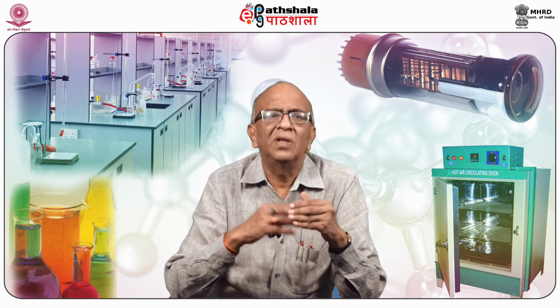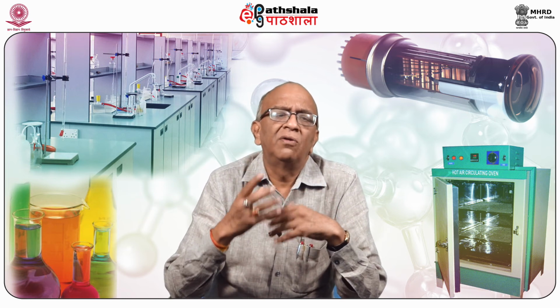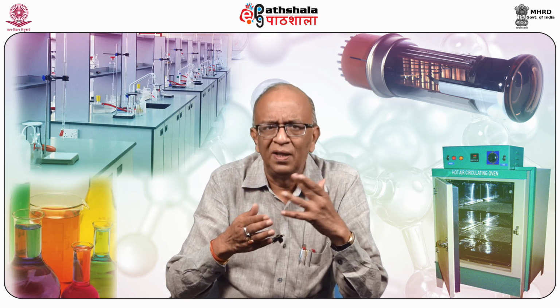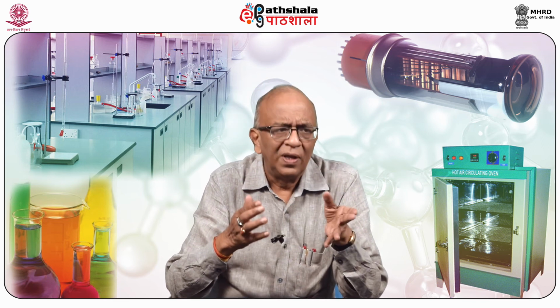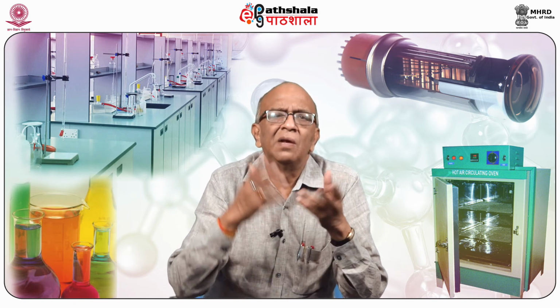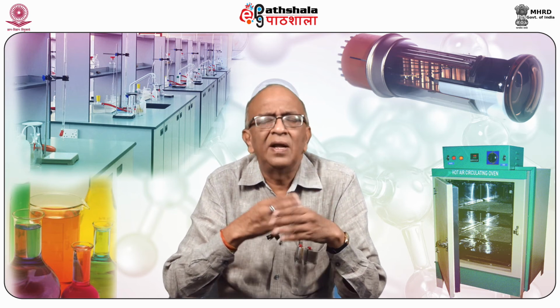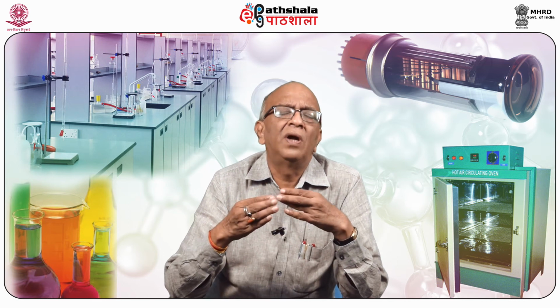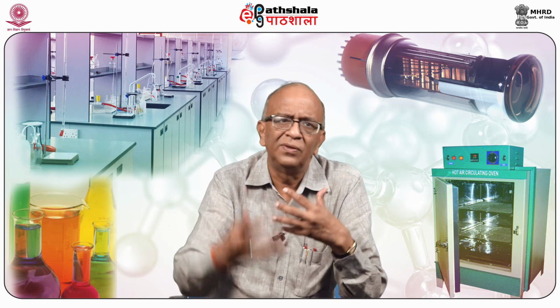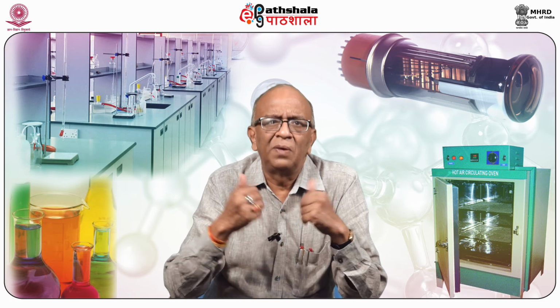But one of the limitations of paper chromatography is that when we develop the spot, there are diffusions. There may be merging of two or three spots. Spots which have closer partition coefficients may not be separated differently. Tailing may be there, and tailing may superimpose with each other. Also, it cannot be used for quantitative purposes. When we want to obtain the substances separately from a mixture, that is very difficult by paper chromatography.